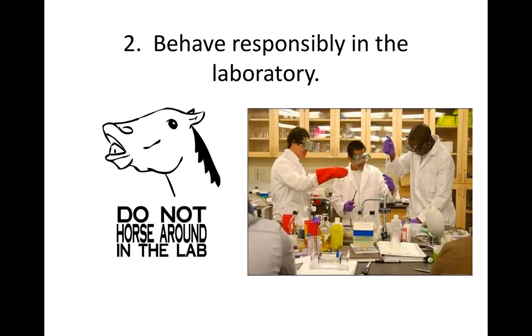You do not horse play or do anything that can cause the glassware to break or the chemicals to spill. So you have to behave responsibly. When we say behave responsibly, it means no playing around and just doing what is required of the laboratory experiment.